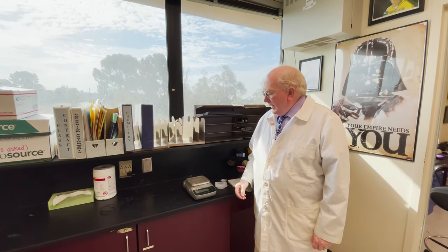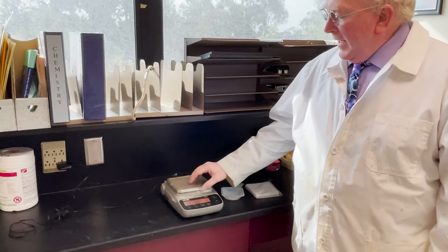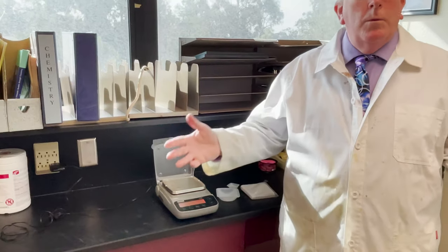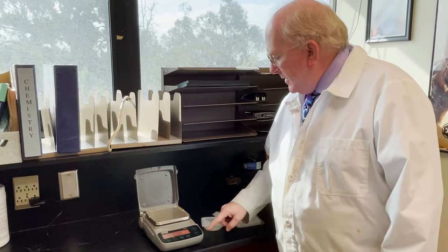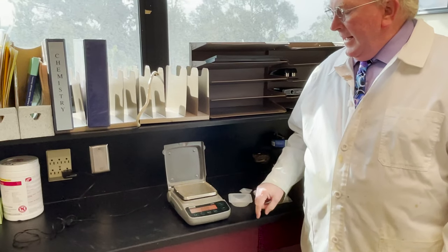This is a typical looking electronic balance. It has an on switch that you push. It has a lid that you need to lift up — if you don't lift up the lid, it won't work. It cycles through some startup stuff and it should read 0.00 grams. If it doesn't, you push the button that says zero and it will zero out the balance itself.